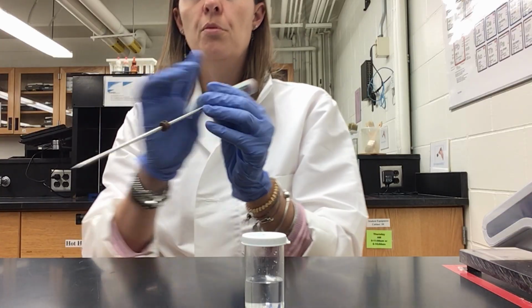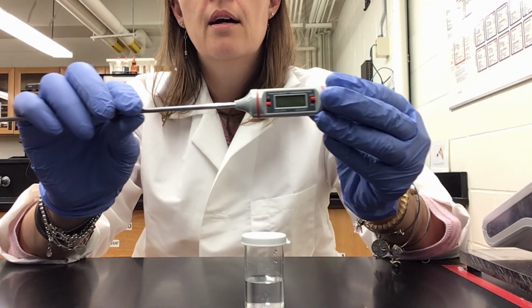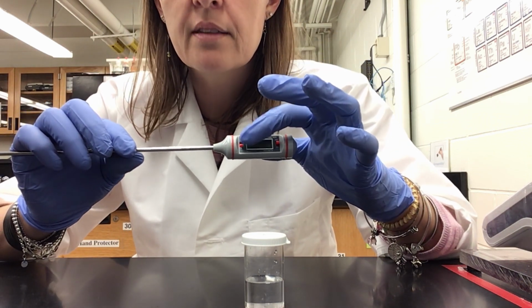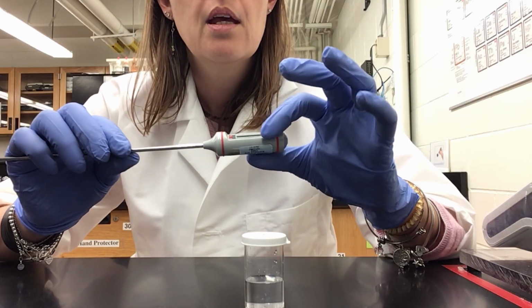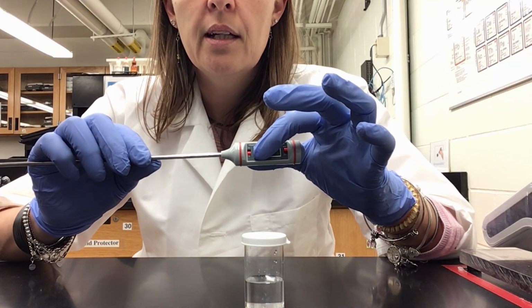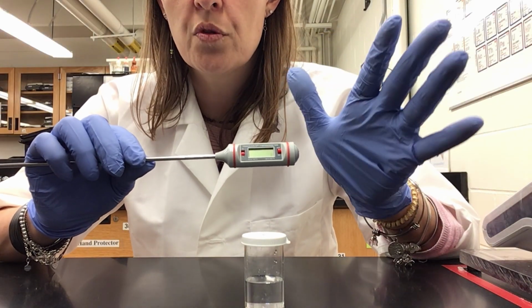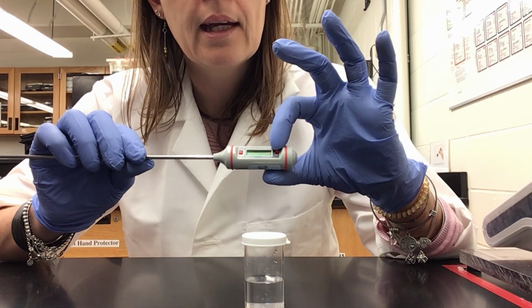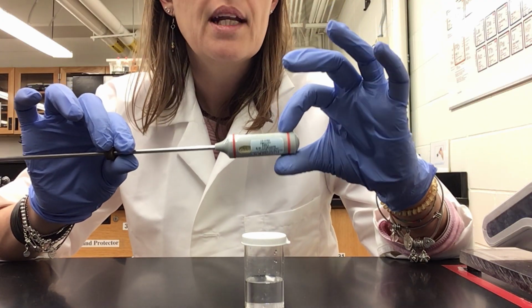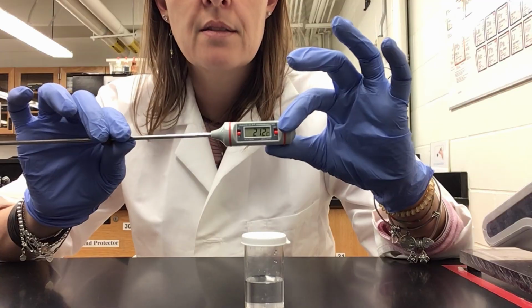So this is a thermometer that you find in the lab, okay, so never touch this. And here you can see the on-off switch, and then Fahrenheit, centigrades, Celsius degrees. So here you see the on-off switch, and here you see the Fahrenheit Celsius degrees option. So we are doing science, therefore we are going to use Celsius degrees, okay? And we are going to turn on the thermometer. So right now it's saying that the room temperature is 21.2 degrees Celsius.